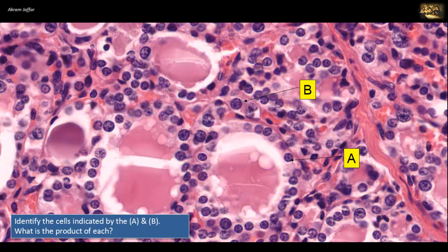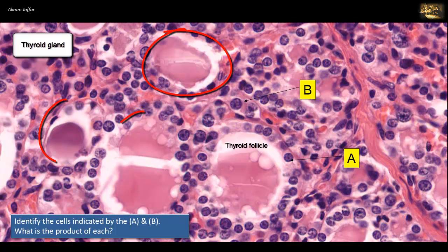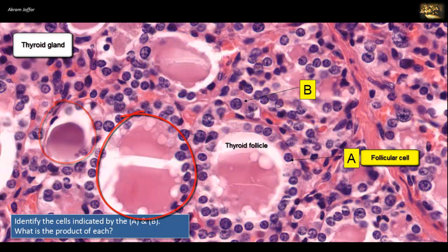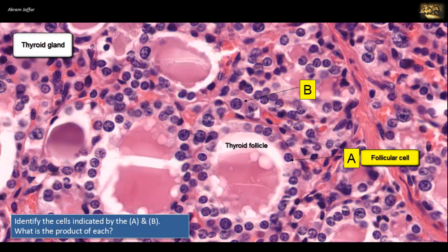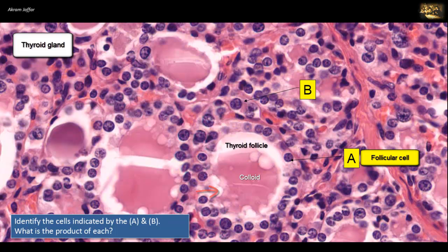Identify the cells indicated by A and B. What is the product of each? This is again a section of the thyroid gland showing thyroid follicles lined by follicular cells, one marked A. They are simple cuboidal epithelium with centrally located rounded nuclei. In active follicles, the follicular cells extract stored thyroid colloid from the lumen and convert it into active hormones T3 and T4. The scalloped pale edge of the colloid indicates where colloid has been removed during activity.